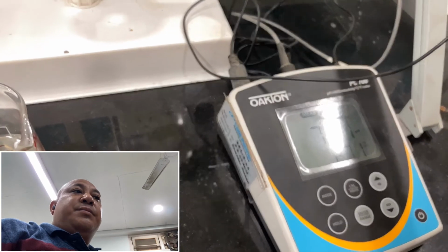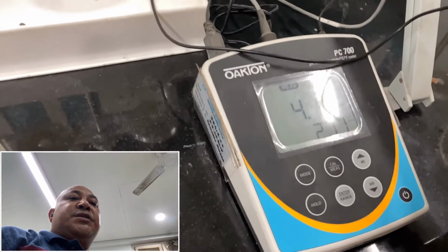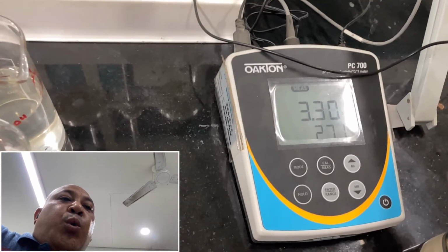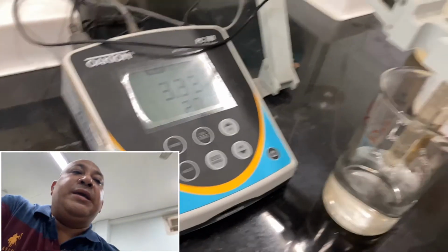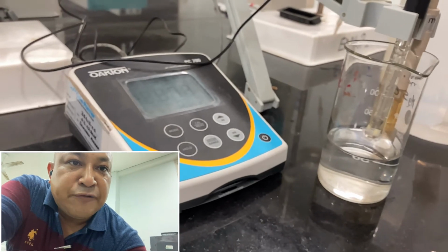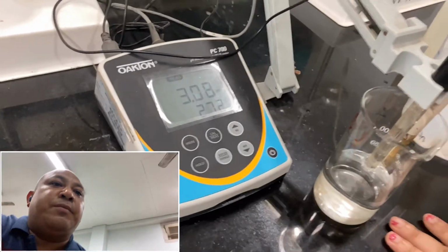Let's check with the acidic one. Yes, correct. This sample is an acidic pH sample. We collected it from industrial effluent. One very important thing is that the sample while measuring should be completely transparent. We obtain this by filtering. The presence of solid impurities also interferes with the movement of the ions towards the electrode and gives a wrong result. Therefore, we completely filter it.